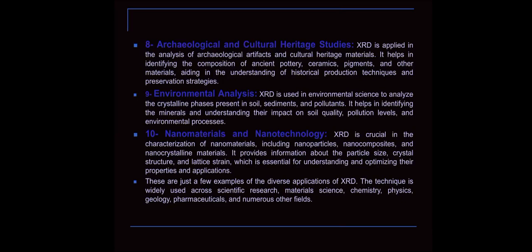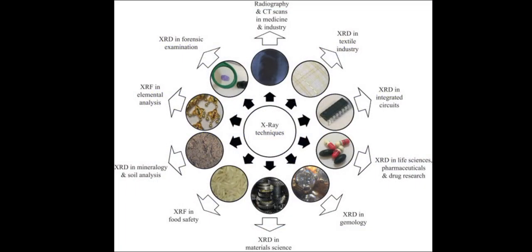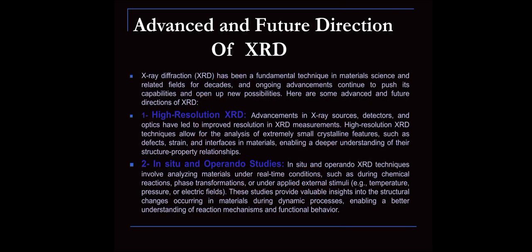These are just a few examples of the diverse applications of XRD. The technique is widely used across scientific research, material science, chemistry, physics, geology, pharmaceuticals, and numerous other fields. This is the diagram of the X-ray technique. Advanced and future directions of XRD. Here are some advanced and future directions of XRD.